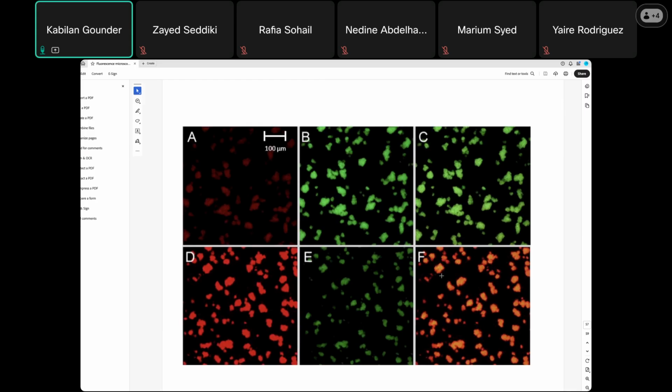So this we cannot see without the fluorescence technique. The purpose of this: the concentration of the antimicrobial agent is not enough to kill the biofilm, and it also reflects that it does not penetrate deep into the biofilm. So this study suggests that one, the concentration is low, and the other, this antimicrobial agent is not able to penetrate deep into the biofilm and kill the bacteria.